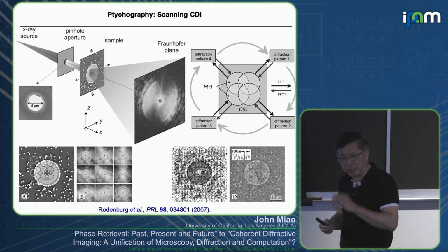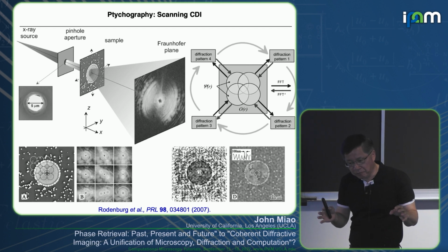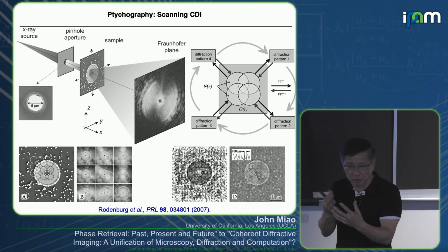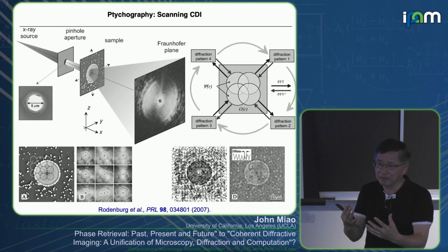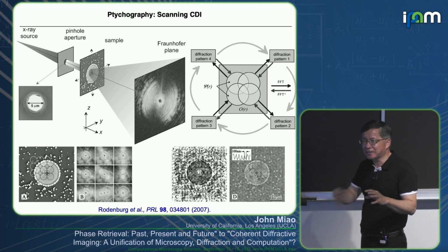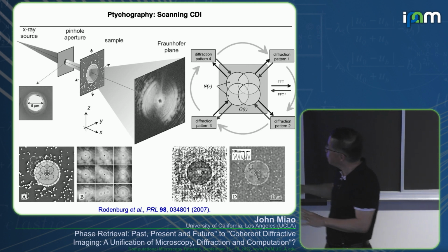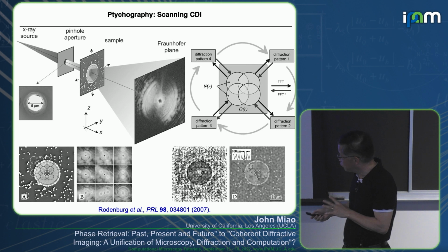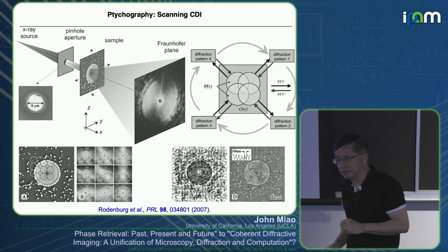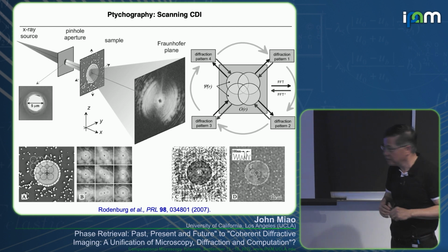Now, another technique, as I mentioned, is called ptychography, also a kind of scanning CDI. Ptychography: ptycho means overlap, from Latin. Graphy is writing. Overlap writing. It was originally proposed in 1969, but that was actually more for crystals, where you overlap Bragg peaks. But the modern version is really by John Rodenburg, and Angus and Peter and Nellist also did very important pioneering work.